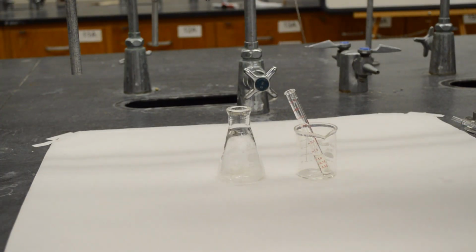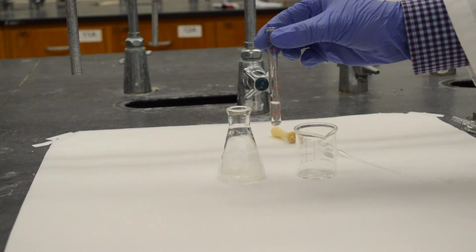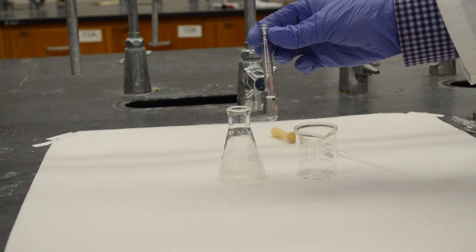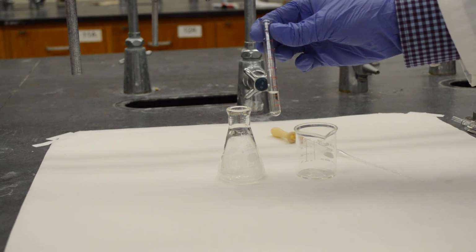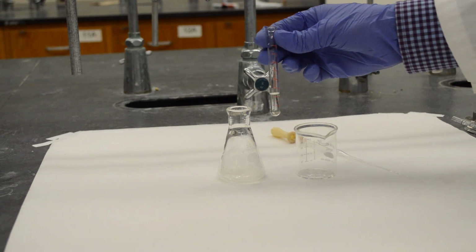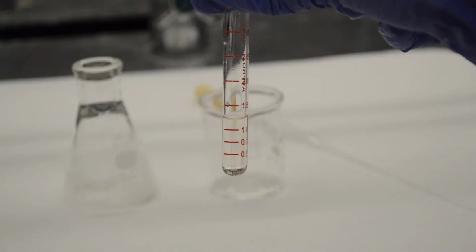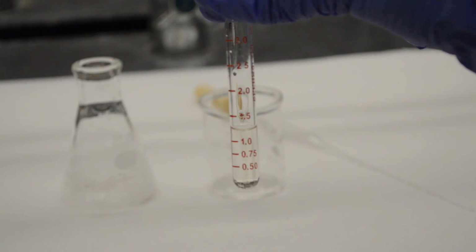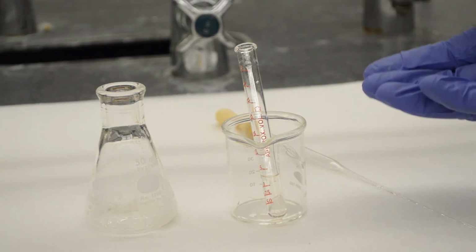Okay, that's how much I could extract. The final volume of our product is about 1.3 ml, 1.3 milliliter. That is the ester amyl acetate, the banana oil. So we synthesized an artificial banana oil in our lab. It smells good. The next step is to do the IR spectroscopy and NMR spectroscopy.